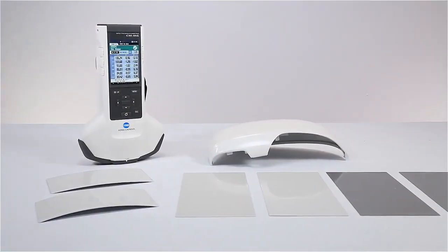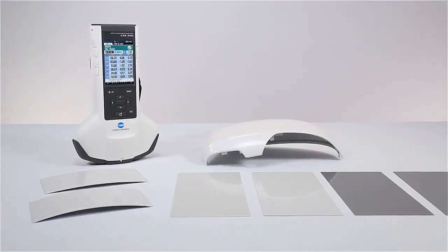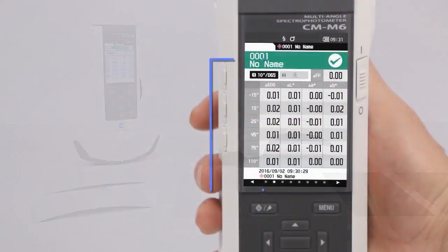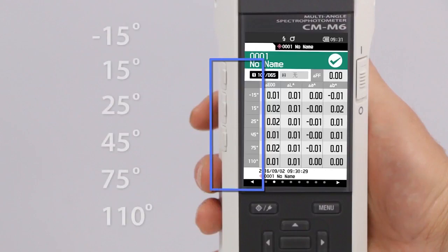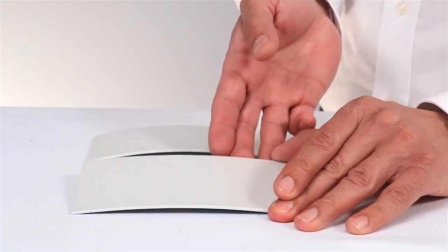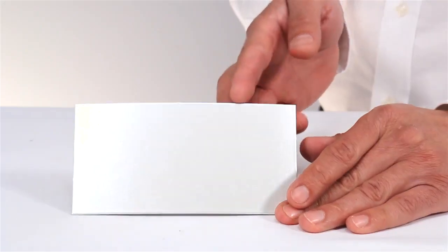The CM-M6 provides measurement data at six selectable angles, ideal for capturing finishes that exhibit visual changes at different angles.